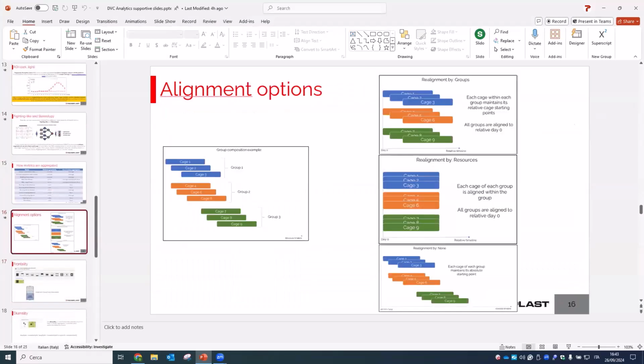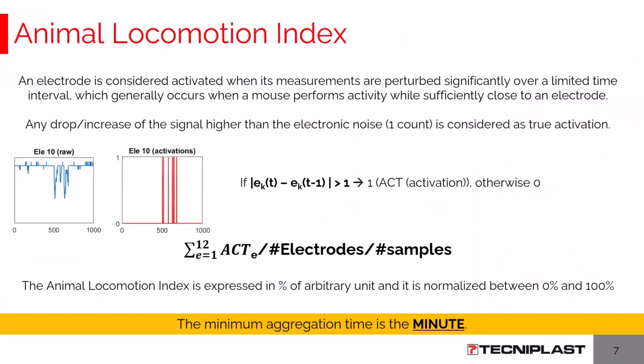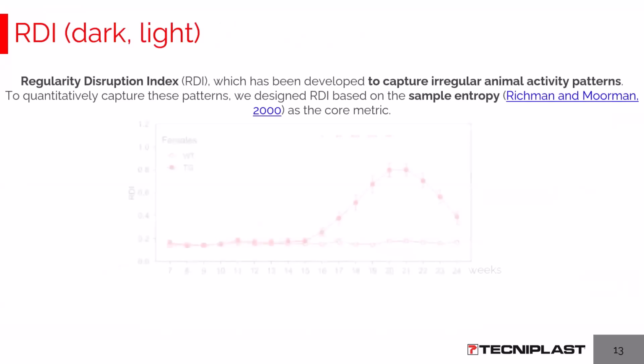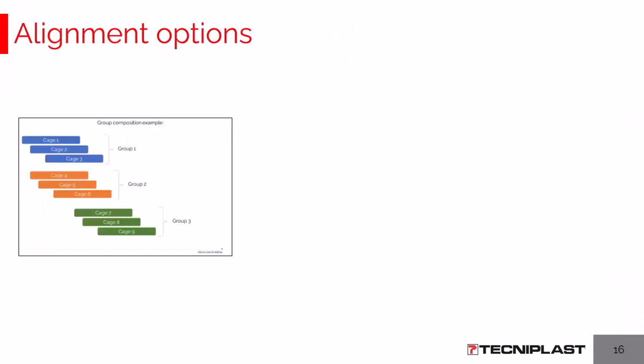Alignment. F5, sorry. I skip all this part just to be quick. My mistake. Here it is.